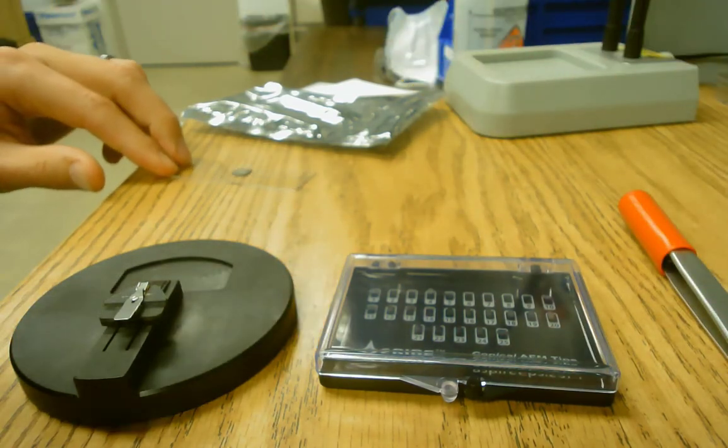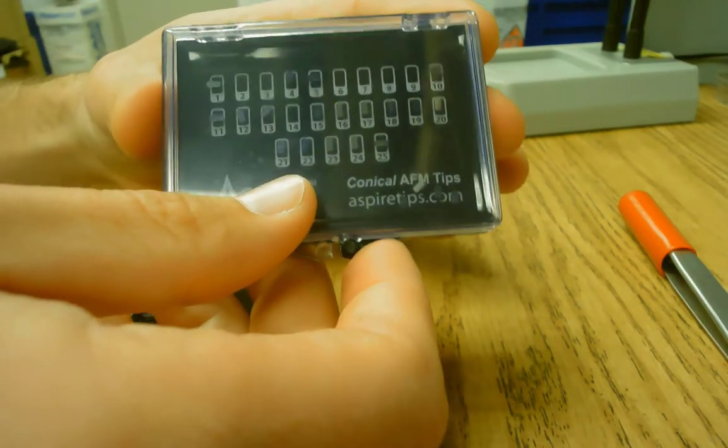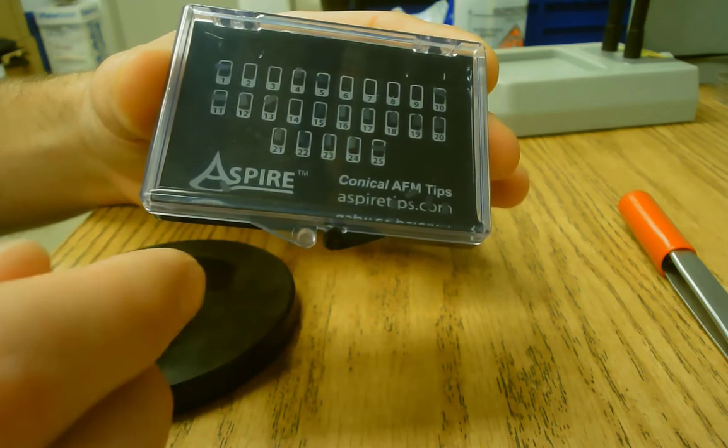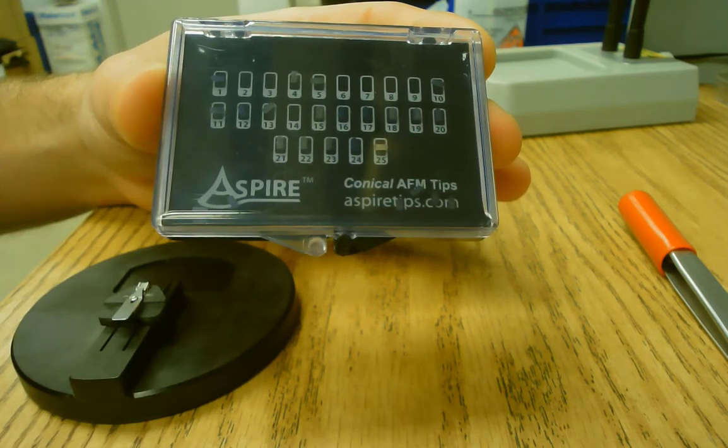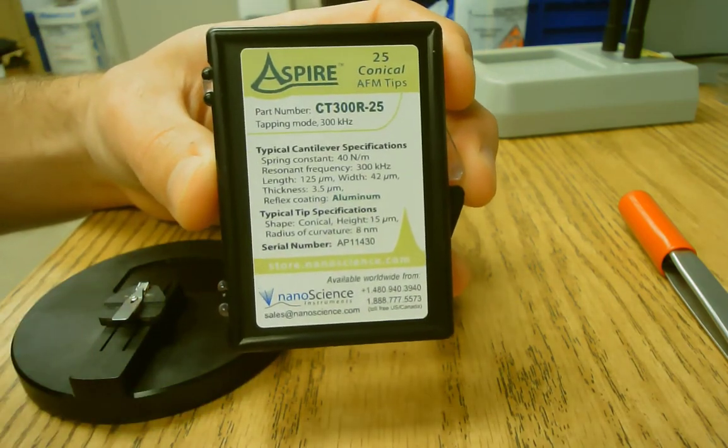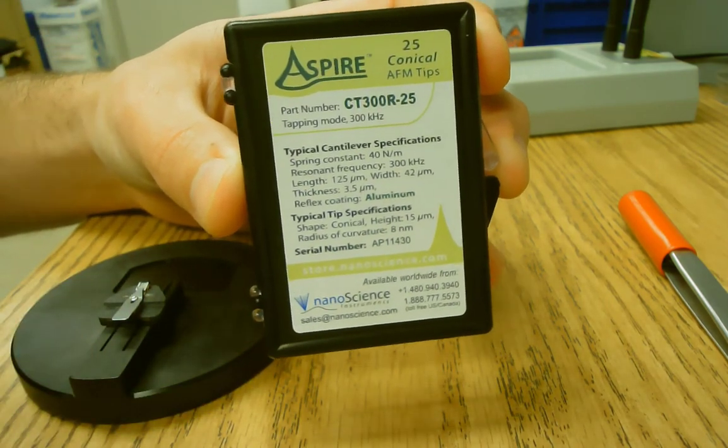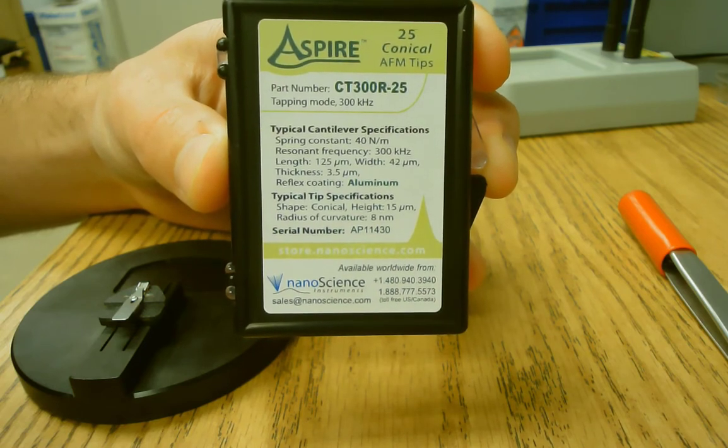And then we have our tips. So the tips usually come in a box similar to this. They can look slightly different. But these are specifically tapping mode tips made by Aspire.